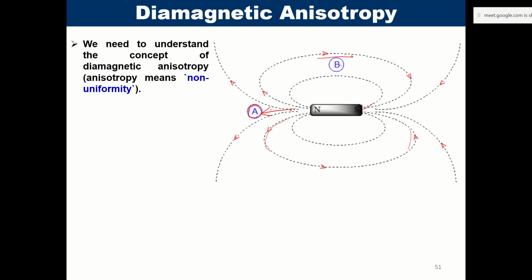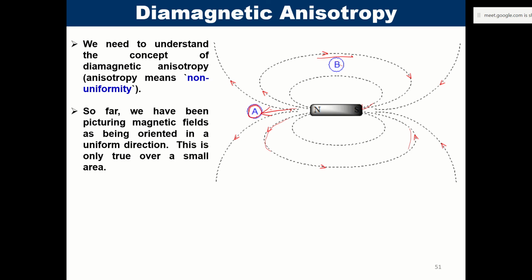ठीक है. And somehow something like this happens, and you see an unexpected decrease in the chemical shift values for the methyl protons. So something like this will happen. How it will happen, you will slowly get that idea too.